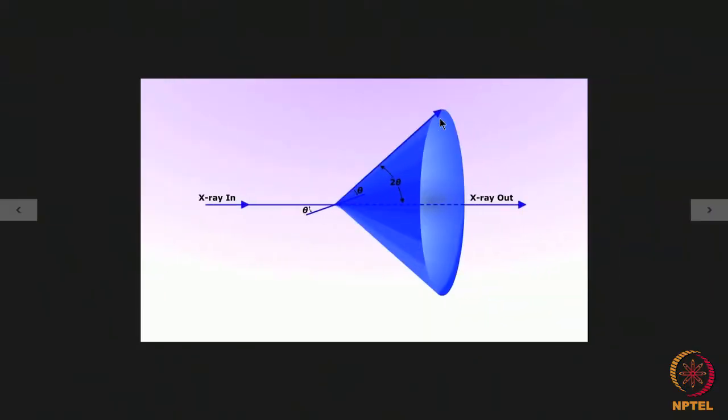So this is the situation. We have a particular type of HKL plane making the correct angle for Bragg diffraction in one of the crystallites, considering many, many other crystallites where also this HKL plane is in a condition to diffract. Looking at all the diffracted beams from this particular type of plane, we'll find that the diffracted intensity will come out in the form of a cone.